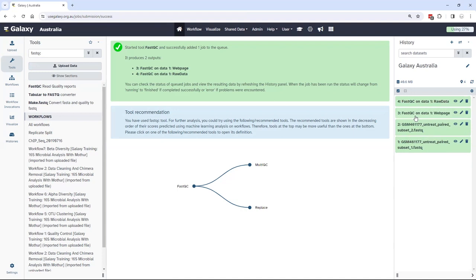Right, that tool went from queued through the possible running state, which is shown in orange if you see it fast enough, and back to green for completed.